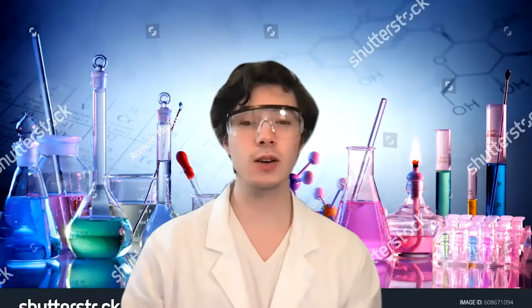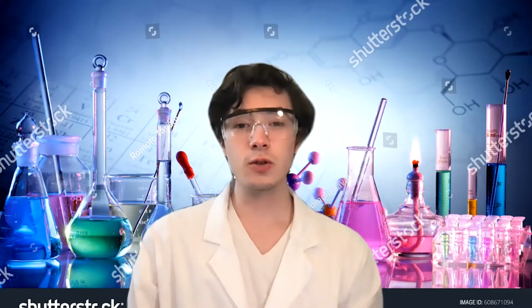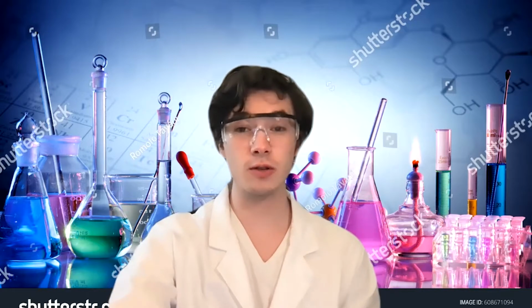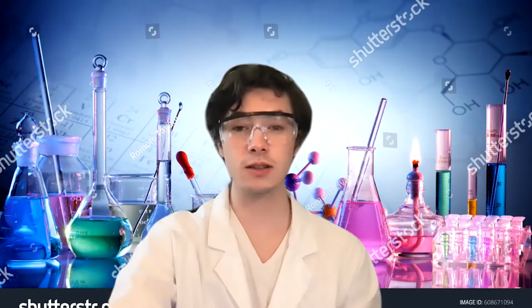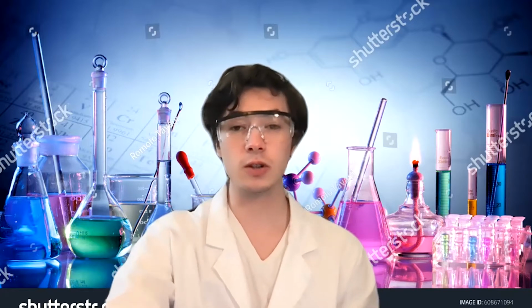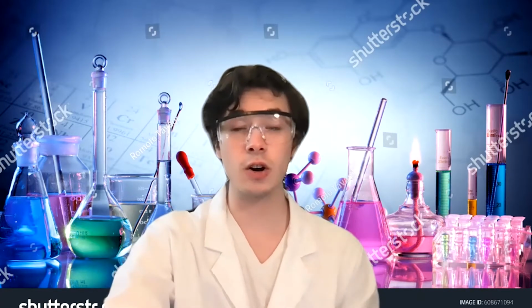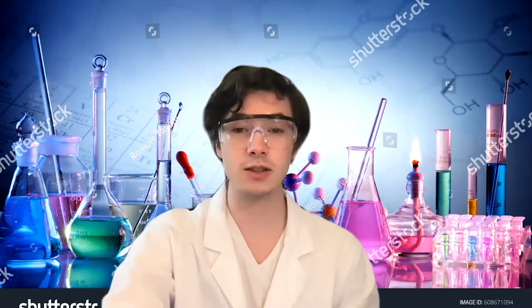Welcome back. Today, we're looking at the synthesis of 4-benzylidene-2-methyloxazol-5-one. We're going to be calculating its overall percent yield, determining the purity of the product that we synthesized in the lab, and finally, we're going to be looking at a potential byproduct that can happen if an unwanted reaction occurs. After that, we'll check out our own synthesis, where we create our own synthesis reaction.